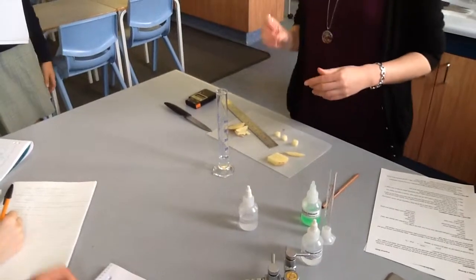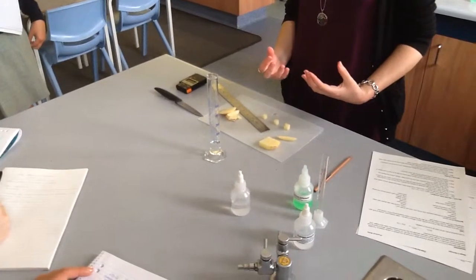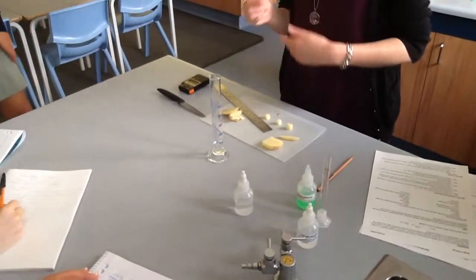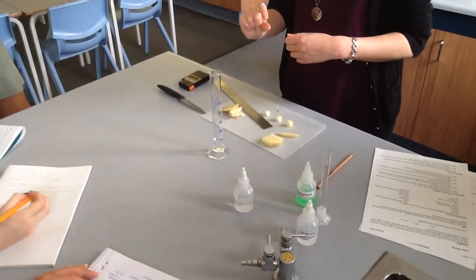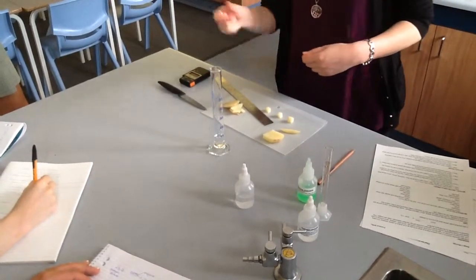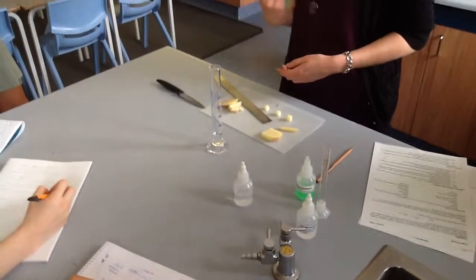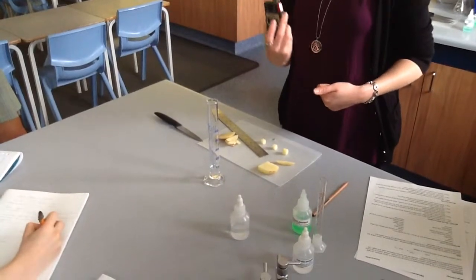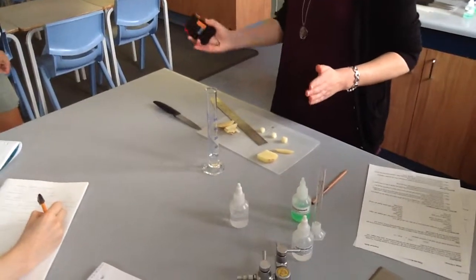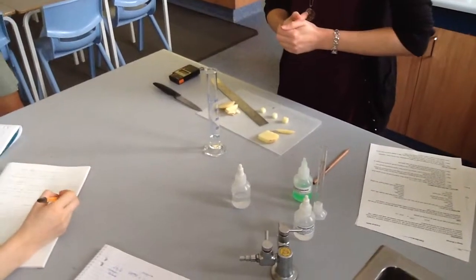Now, when I add my catalase to the hydrogen peroxide and that reaction starts, we're going to produce some oxygen gas. As the oxygen gas bubbles form, they're going to make the detergent froth up. So you can measure how much foam and use that as an indication of how much oxygen has been produced. But I have to time it, because I want to know how much oxygen is produced in a set amount of time, because that can then be used to work out a rate. Obviously, more foam in the same amount of time means a higher rate of reaction.